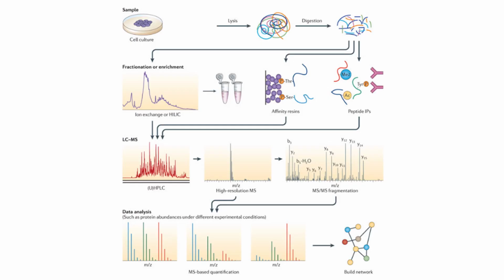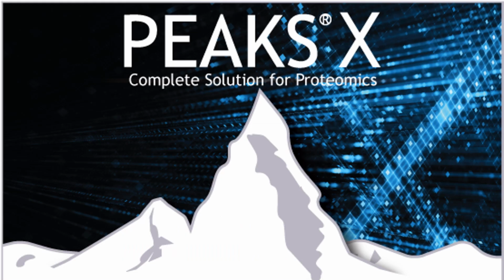The first part of this experiment was to get the protein from the samples. We did the cell lysis and the digestion with tryptic enzymes. What we got at the end of that was a spectrum, or several thousand spectrums, from those proteins. Those spectrums in themselves don't mean much unless they are associated with certain peptides or proteins. That's where this software comes along, PEAKS. What it does is assign a peptide to a spectrum, and those peptides can be mapped to a different protein. Now they use different statistical analysis to assign scores to this protein.